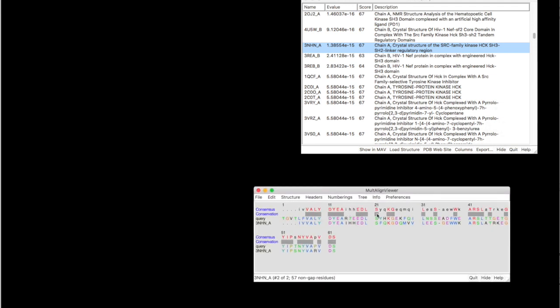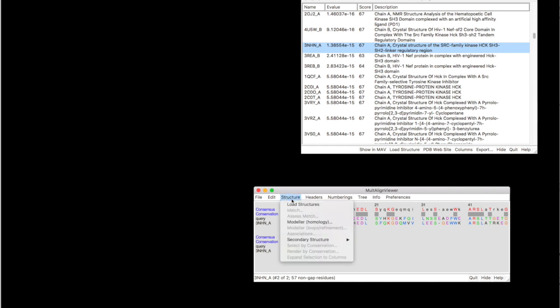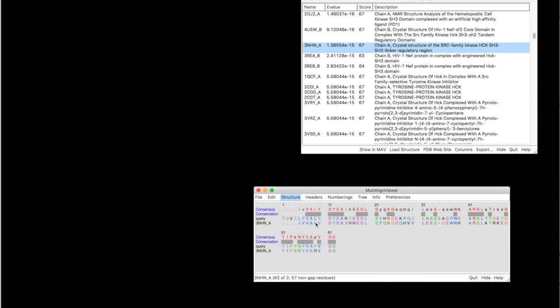So the conservation here is as you can see here. Now, if you want to launch the actual homology modeling modeler, you go to structure, select modeler.